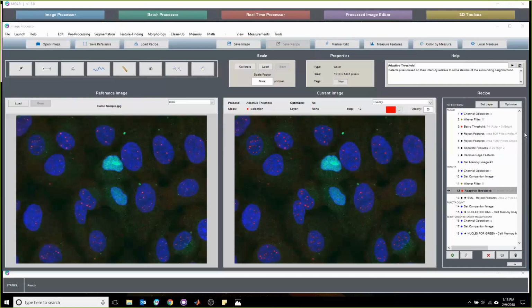So I'm guessing you're referring to collecting, if you have a Z-stack from confocal images and you have data at different Z's that you want to compress together to minimize the noise and maximize the signal you're interested in. At this time, we don't do it directly in MIPAR. There are some workarounds that we can do to achieve this. Oftentimes it's much more efficient to do this in your acquisition software. The software that you use to capture these images oftentimes allows you to export the images in a certain fashion where the maximum projection is an option there.